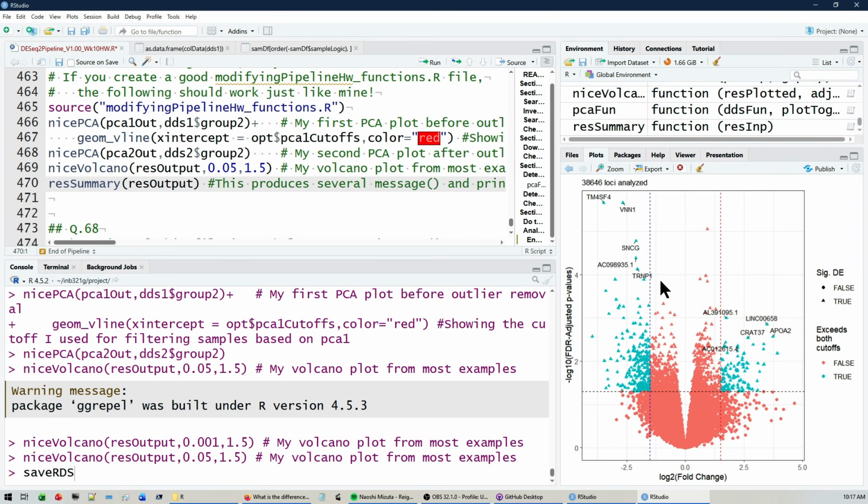Finally, my plot isolated the genes in this corner and in this corner, and it plotted the names of, I think, the top 5 genes per corner. There are a lot of ways that I accept you doing the names. Really what matters is that it works for your plot. What matters is what makes a nice plot, because really the only ones that should be labeled or somehow indicated are any that you are then talking about in your analysis. So here I've been pretty safe, and since I'm probably going to be talking about these two, I labeled them. But there was plenty of room on the plot, so I also labeled these and these over here.